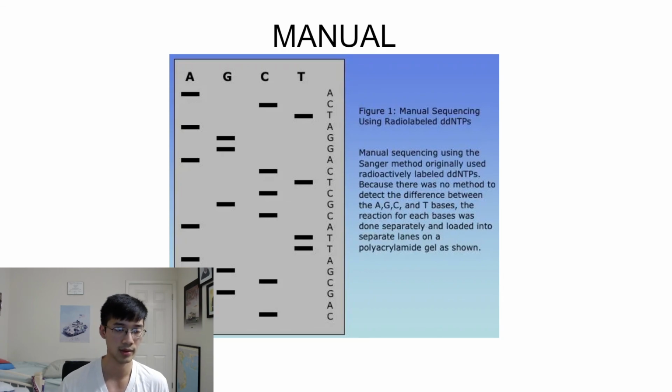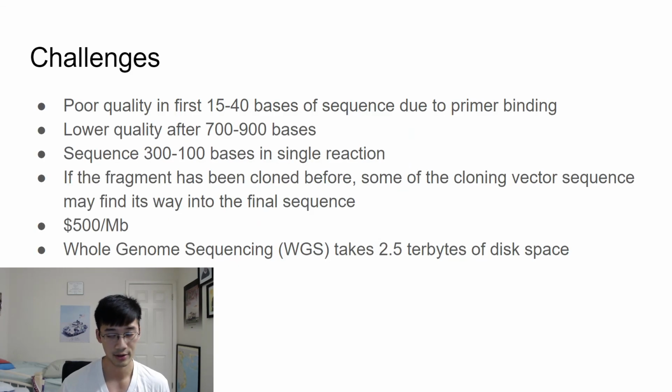So my partner will now go on to talk about challenges in Sanger sequencing and discuss alternatives like next-gen sequencing.